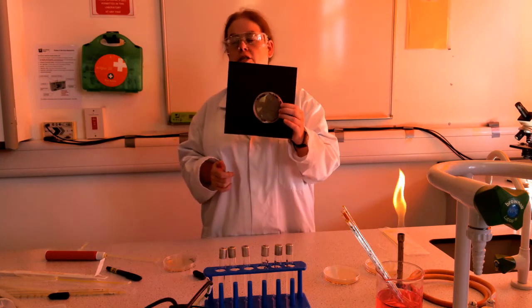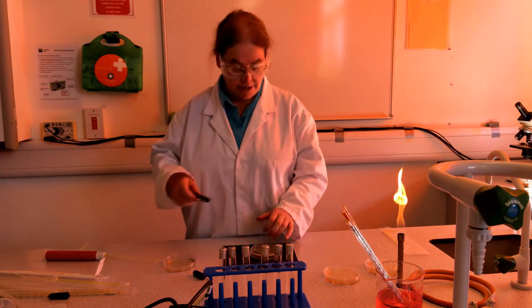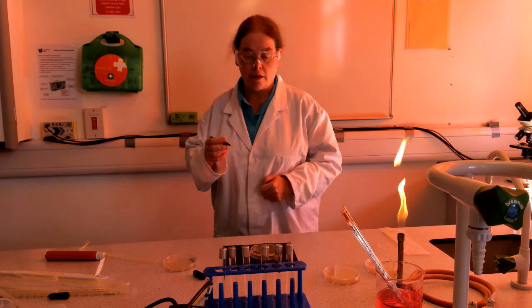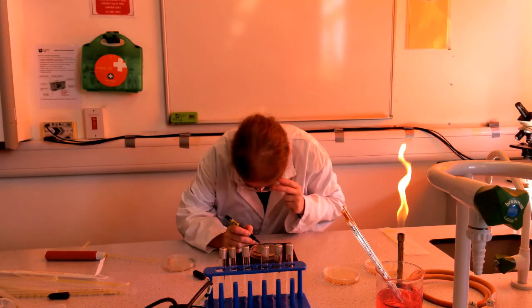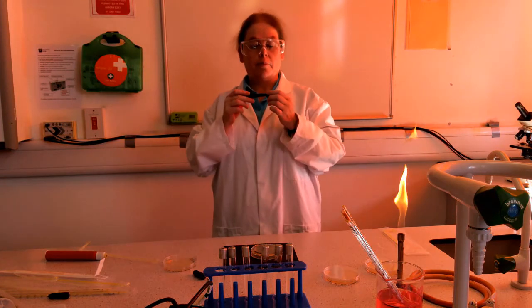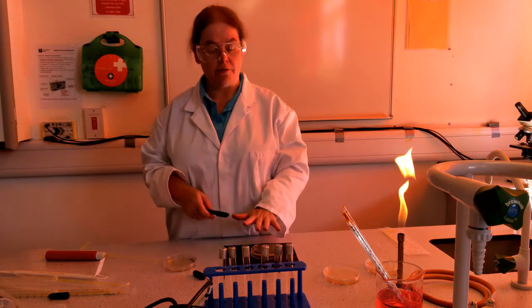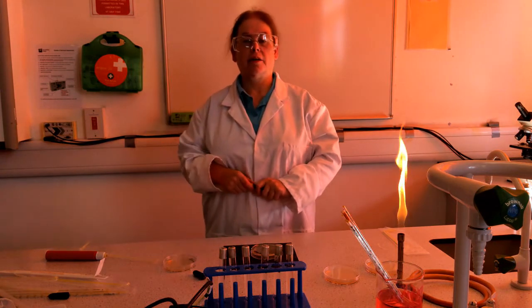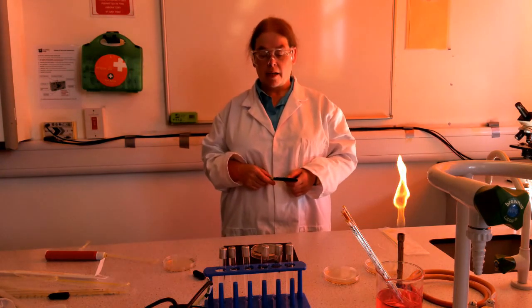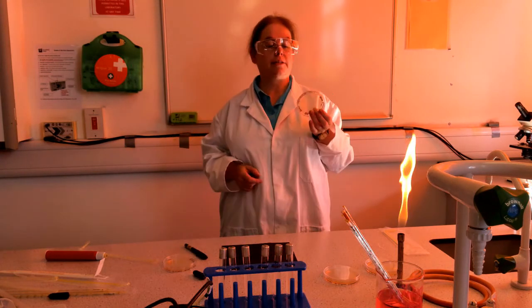So what I need to do now is count how many colonies. And the best way to do that is over the black card, jelly side up. I sit here and I go 1, 2, 3, 4, 5, 6, 7, 8, 9, 10, 11, 12, 13, putting a dot with a marker pen over each colony as I count it, so I don't count any twice. I'm not going to make you watch me do that because I reckon there's at least 1,000 colonies on here.